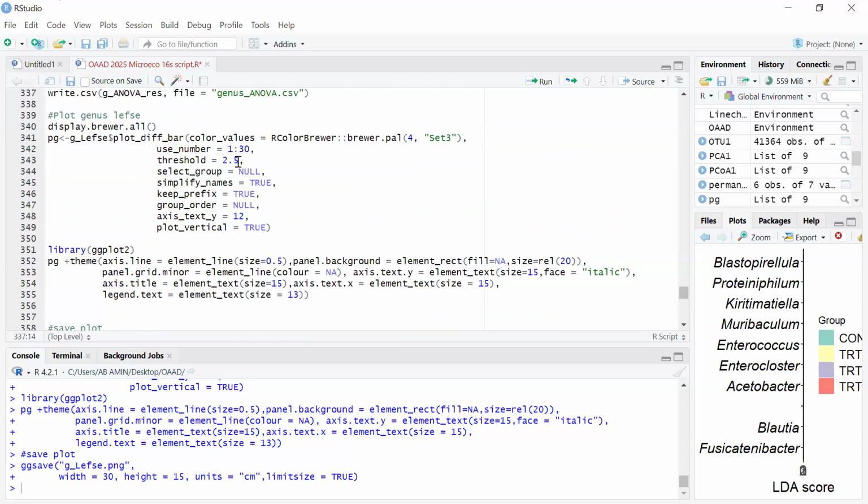At your discretion, you look at literature and put your threshold based on the results you get. If all of mine are less than 2.5, I may decide to put my threshold as 2, and then I will state in the methodology that my threshold was 2. Even if they are less than 2, I can decide to put 1.5. I've seen articles where 1 was used as threshold. So your data will define that.